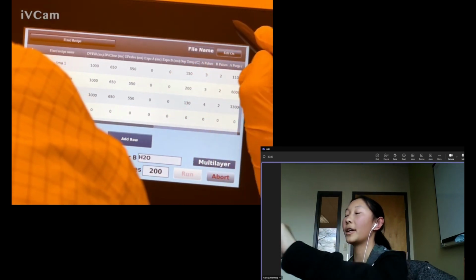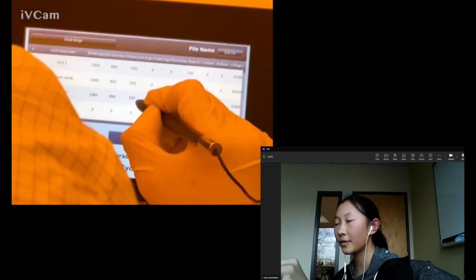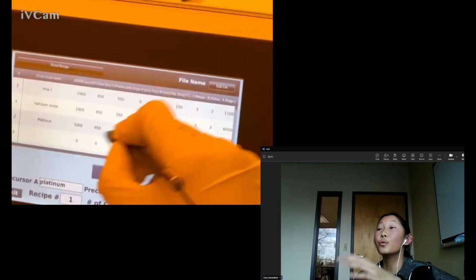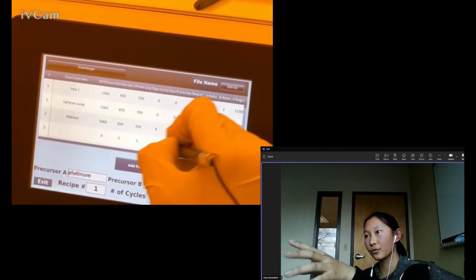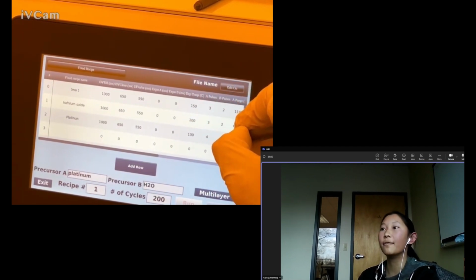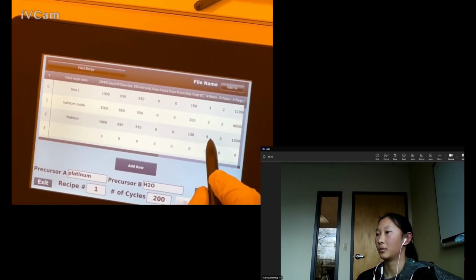You see the DV fill, the DV close, and the valve. Those are the same values that are in the setup page. You can change them here in this recipe, but for those recipes they're the same as the setup page. So for example, in the custom recipe, it's pulling those same values from the setup page.